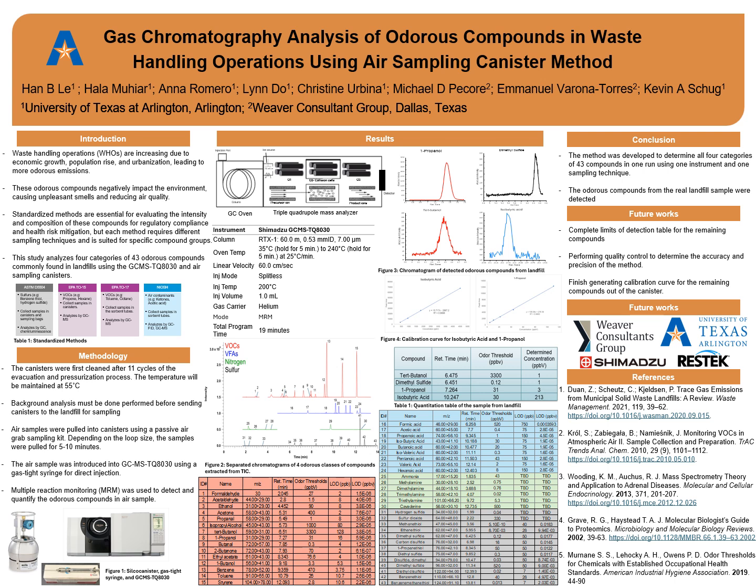and the sample will be evaluated using the triple quadrupole mass analyzer, which is a good mass analyzer for trace analysis. The MRM method, multiple reaction monitoring, is used to detect and quantify specific compounds in a complex mixture. It provides high selectivity by filtering out interference and monitoring only target ions, and gives high sensitivity by improving the signal-to-noise ratio.